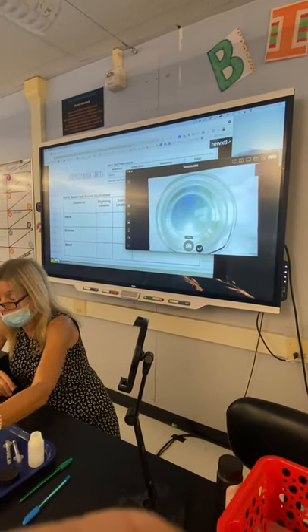Do you remember how you had to do that drawing of what's initially inside? So it's iodine and water — do you see how it's all kind of this orangish color? So when you look at your table on your substance beginning location: iodine is in the beaker, glucose is in the bag, starch is in the bag. And that's what we know right now.